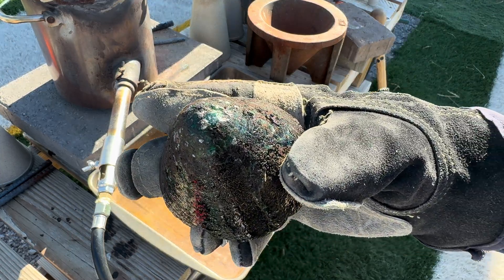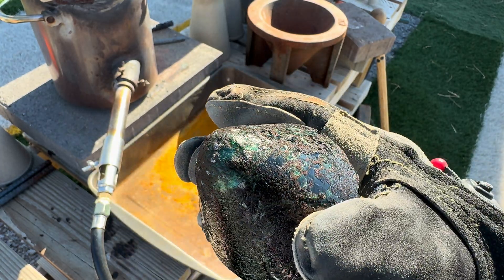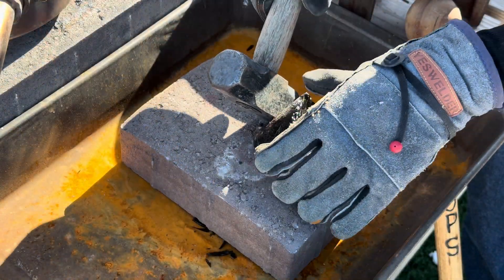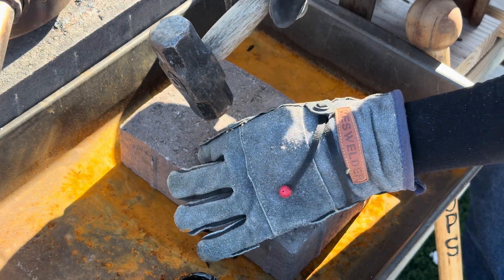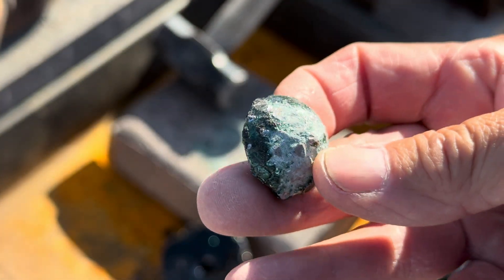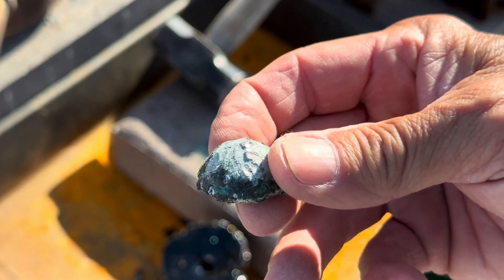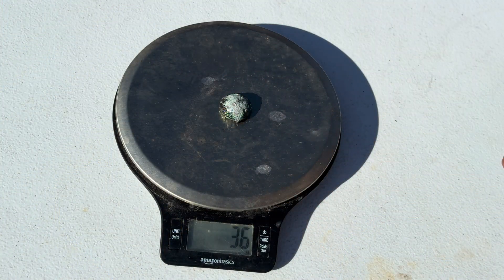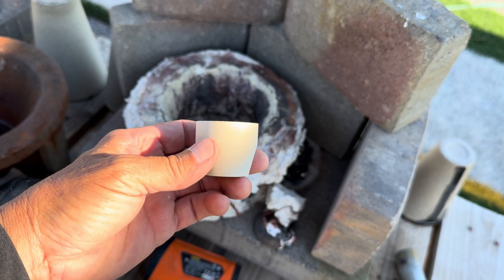Here is our cone. Our lead prill is actually pretty large. Our lead prill weighs 37 grams from 100 grams of high litharge with flour. We will use the cupel rated for 56 grams in this cupellation process.